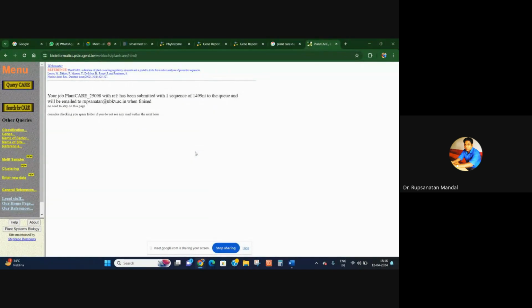So it takes some time. If the sequence length is too long, then it will take a lot of time. If the sequence is too short, then it takes less time. So wait, when the report comes, I'll share it with you. But maybe it will take 5 to 10 minutes. Okay.